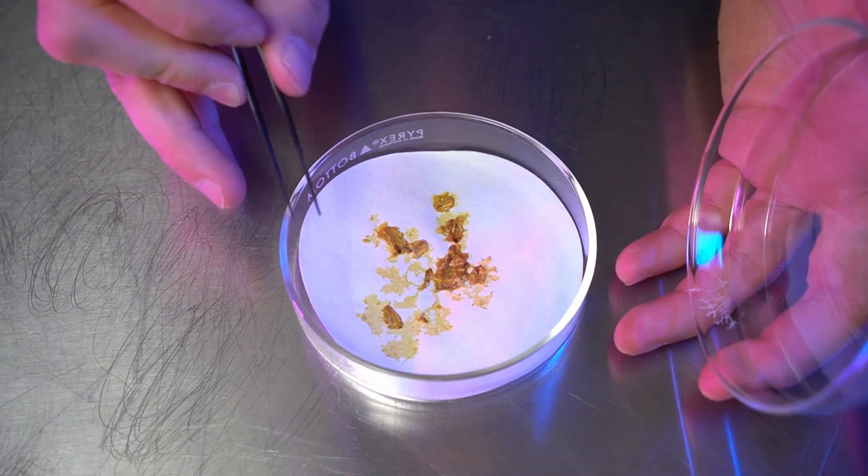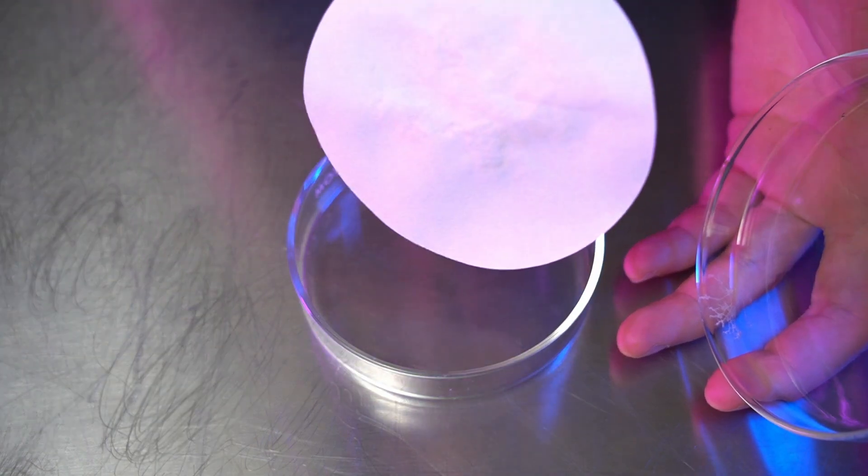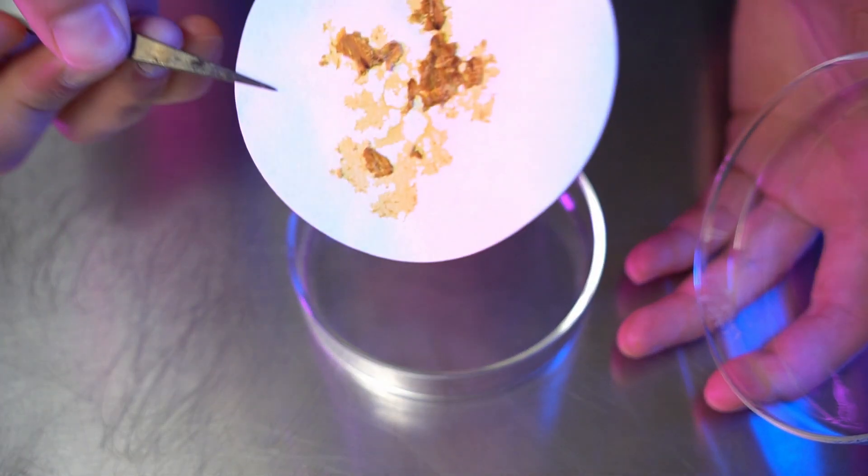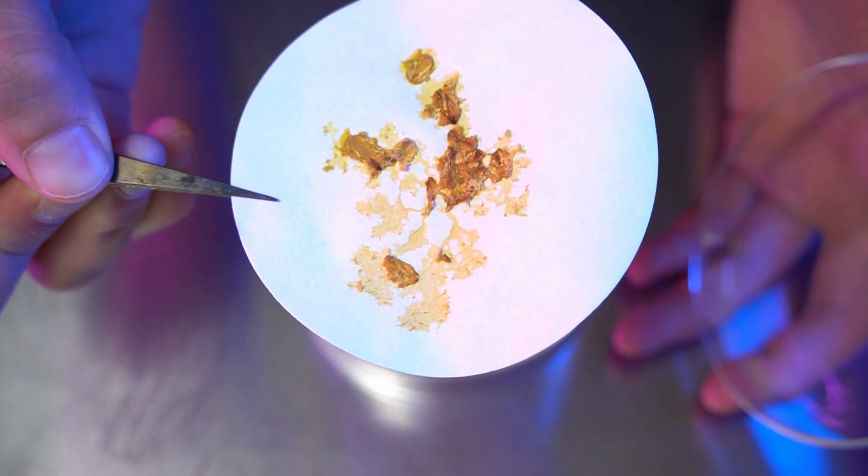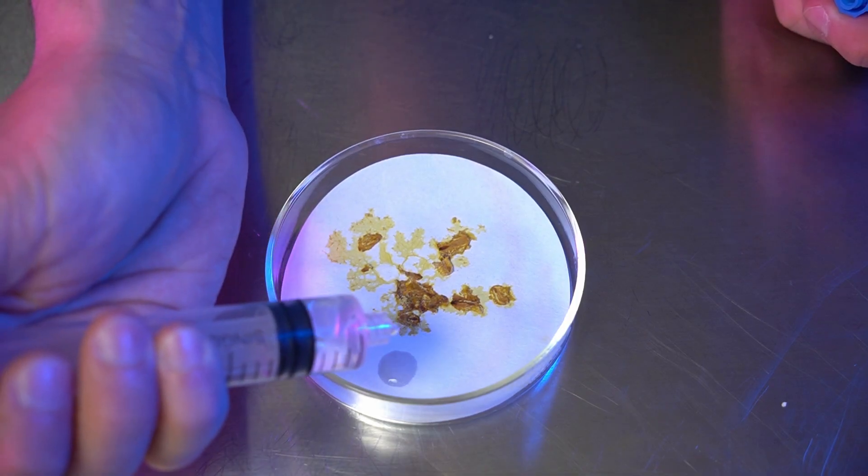One benefit of using filter paper is that you can dry out the culture on the paper disc and save it. This dehydrated, dormant form is called a sclerotium and can be revived by simply rehydrating the paper.